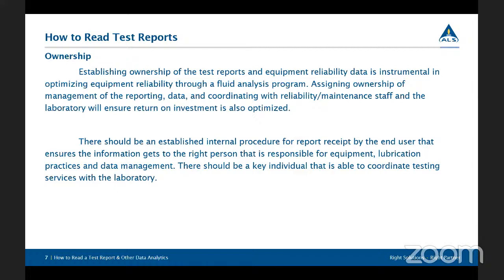So the last thing, this is probably the most boring slide that I've got today, but it's very important, and that's why I want to have it here and read through it, because ownership is really key to an oil analysis program. Essentially the point of you wanting to read test reports is you have to have ownership of what those reports are bringing to the table. Because if nobody has ownership of those reports, if nobody's reading them, trying to gain information from them, then they don't bring any value to your program.